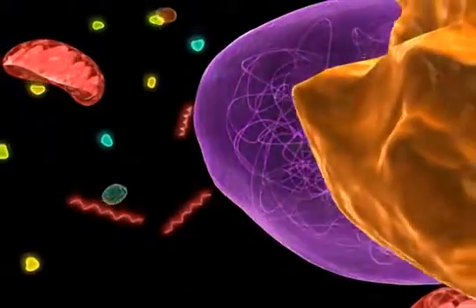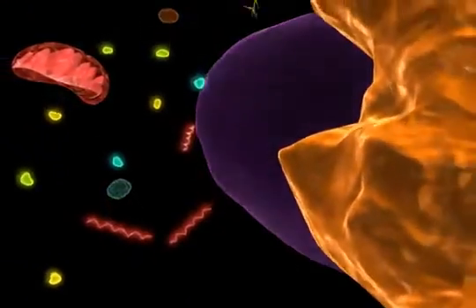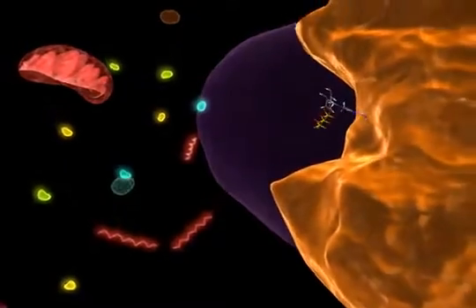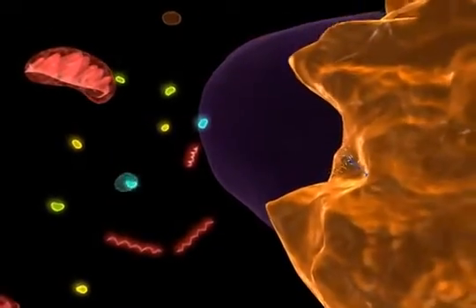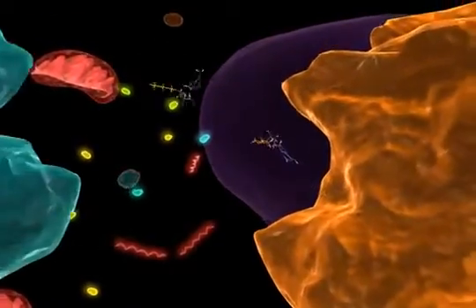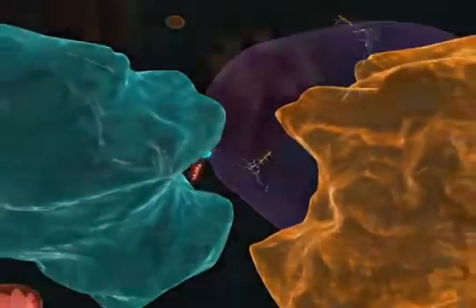DNA and protein quantitation, as well as enzyme assays, can be performed using your choice of detection modes.